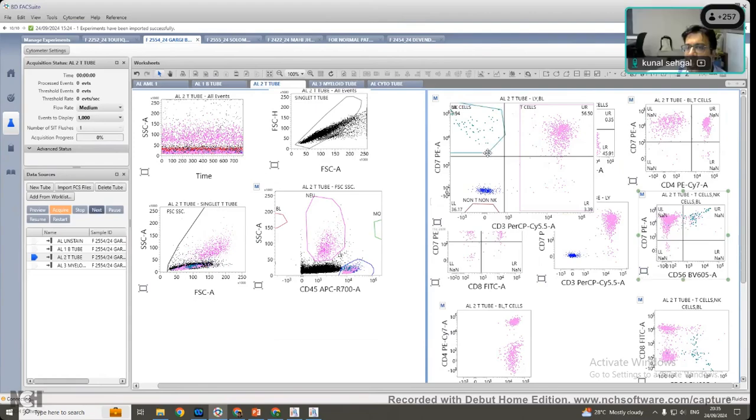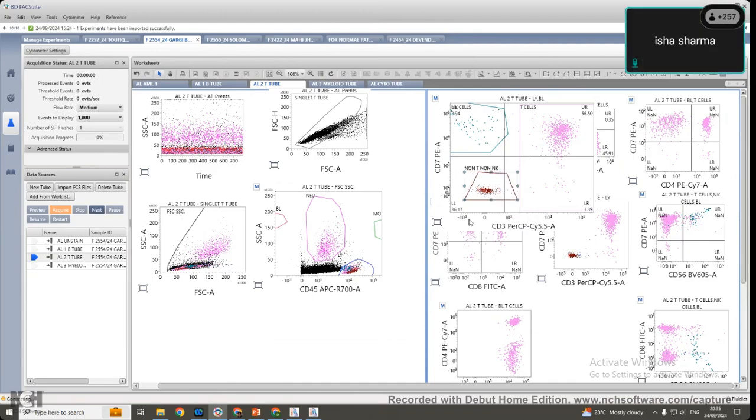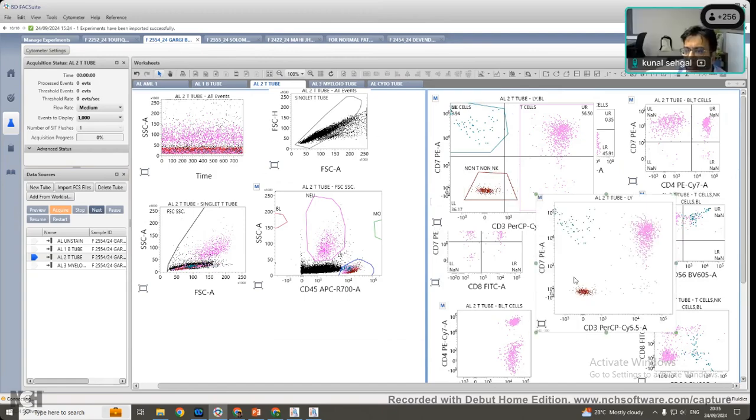Okay. So T cells are CD7 and CD3 positive. NK cells normally are surface CD3 negative, but positive for CD7. So which will be the lymphocytes which are negative for CD7 and CD3 in this brown color? What are they likely to be? T cells are over, NK cells are over. What are these cells? B cells. So you didn't put any marker, but you could study that these are the B cells, these are the NK cells, and these are the T lymphocytes.